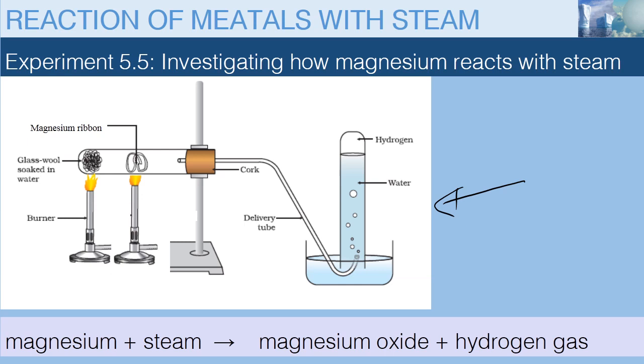We first of all heat the glass wool soaked in water to drive off the air that is initially in the test tube, so that when we start heating magnesium, it does not react with oxygen that is in the air.